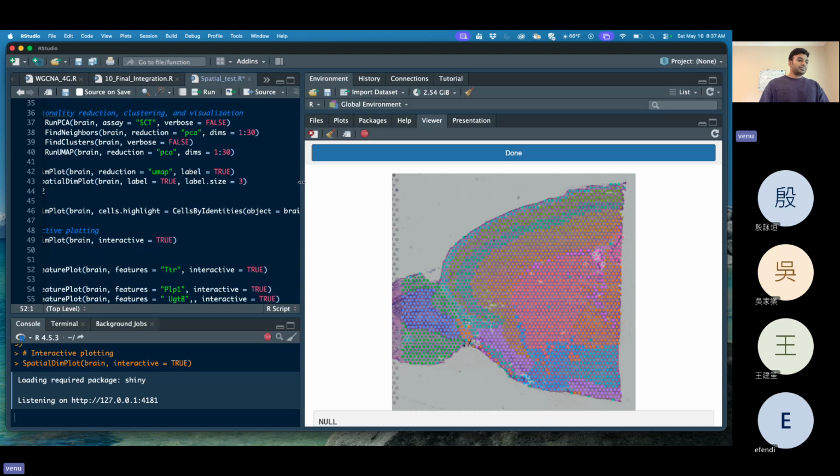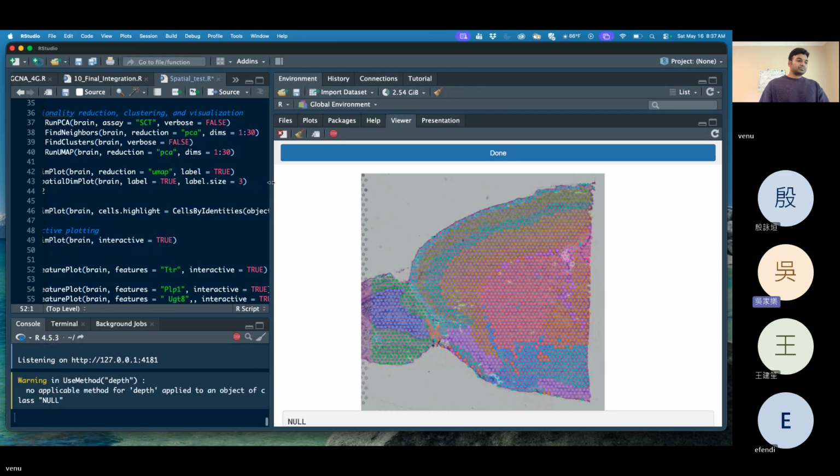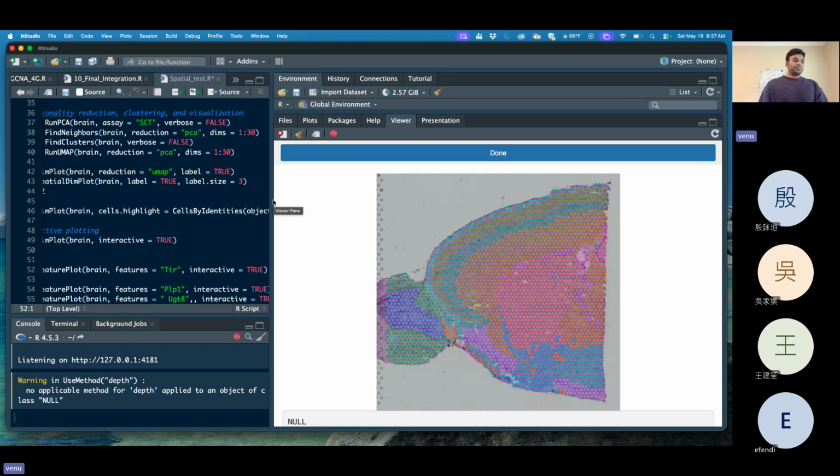Different clusters mean different cell types, or in spatial analysis, different regions, different spots, all similar spots. For suppose, this is one of the spots. You can see my cursor, right? This particular cell type is in group 6, with its cell type, barcode and coordinates. Based on this, the entire region of cells or spots has similar expressions, with high expression of CD4 markers or epithelial cells.